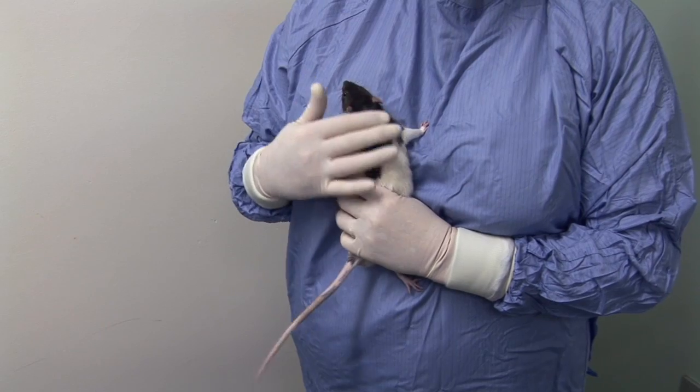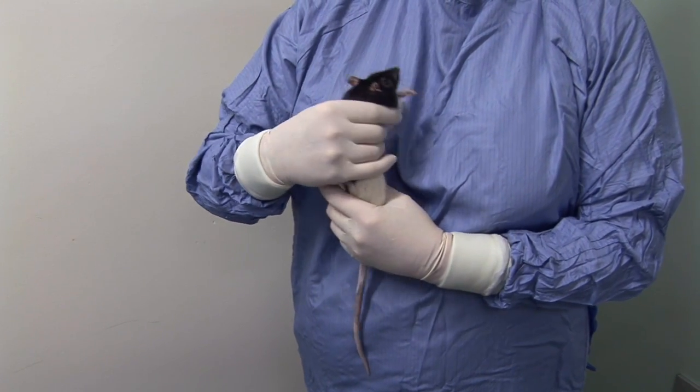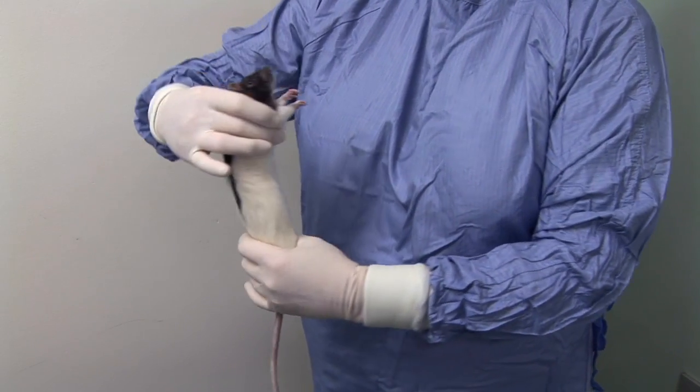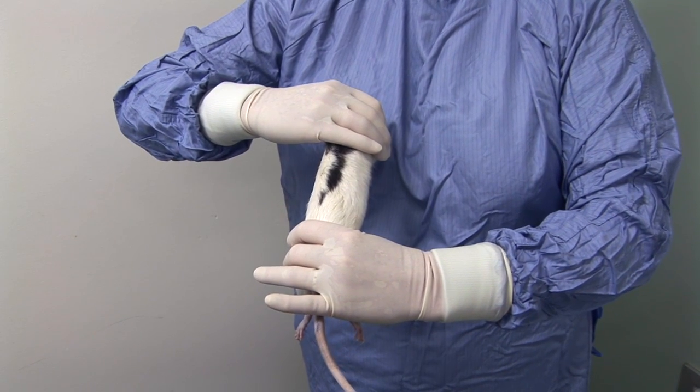To inject into the flank, adjust your grip around the rat's shoulders so that your thumb and forefinger push one or both of the rat's legs forwards, and support and restrain the rat by holding its hindquarters using your other hand.